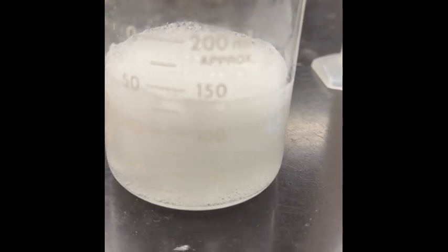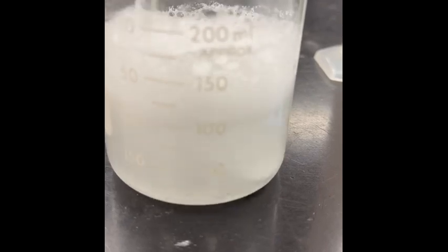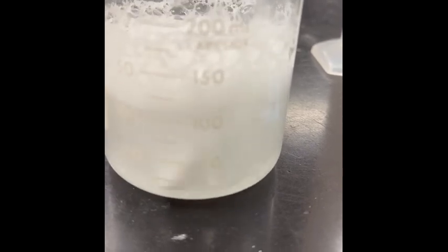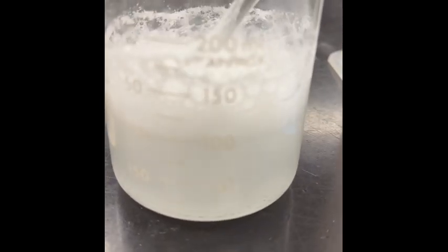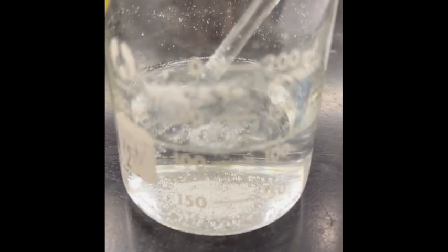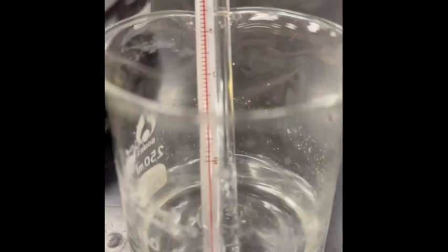We're going to stir, because we want all of that carbon dioxide to escape, so then we can figure out what mass of carbon dioxide was actually made. I'm going to continue stirring, and once it stops, we're going to weigh that again. I still see some bubbles being formed, so we want to wait until they are all gone. Okay, I think all of the carbon dioxide has now left.